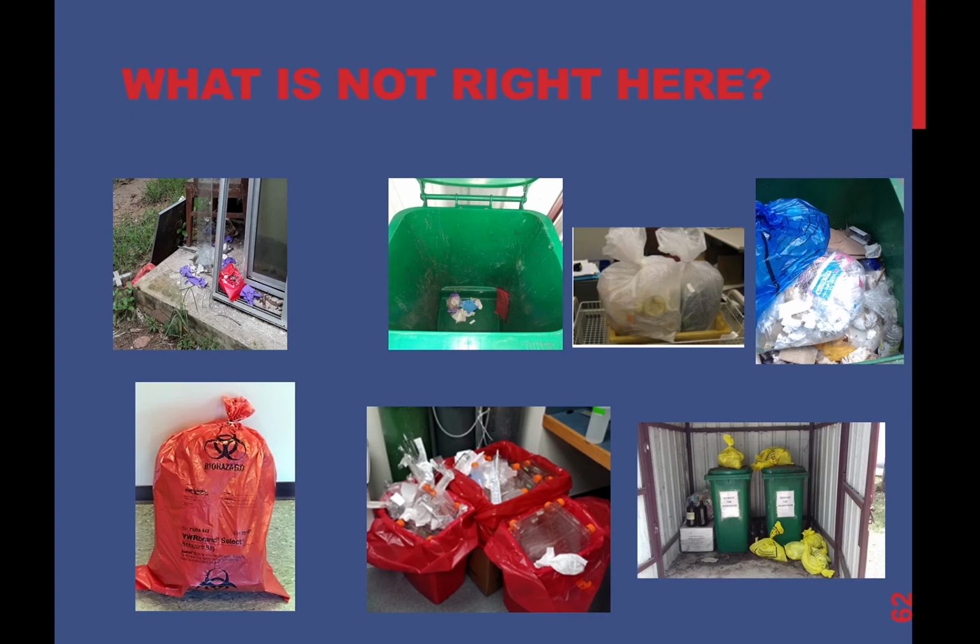So what is not right here in this slide? There are a couple of pictures here that have some non-compliance issues, and I'll go through this picture step by step. First we'll go through the top row, and the first image on the top left is a red biohazard bag which is not sealed. The waste is outside the bag, and all this waste is left in the open. It is not in a biohazard waste can, so we cannot leave the biohazard waste out in the open.